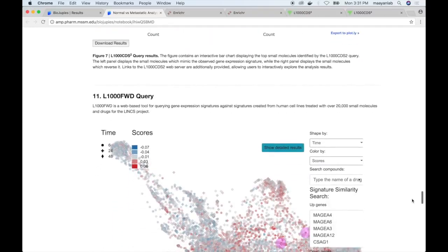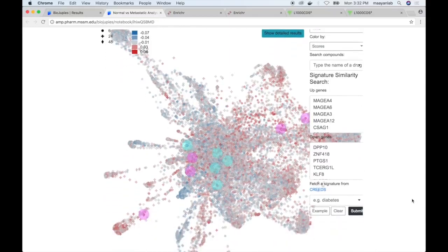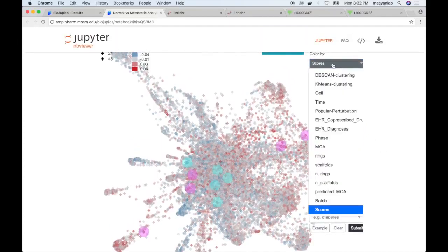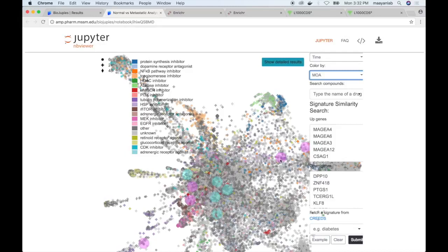The final plugin for today's demo is the L1000 FWD query, which allows querying gene expression signatures against the same database generated from the LINCS project. Each point in this visualization represents a different signature, with red indicating more similarity to the input signature and blue indicating signatures that tend to reverse the input. The user can optionally color the visualization by different approaches — for example, coloring by mode of action reveals clusters such as NF-κB pathway inhibitors, protein synthesis inhibitors, or dopamine receptor antagonists. Purple points indicate the top signatures which reverse the input, while blue points indicate the top signatures which mimic it.